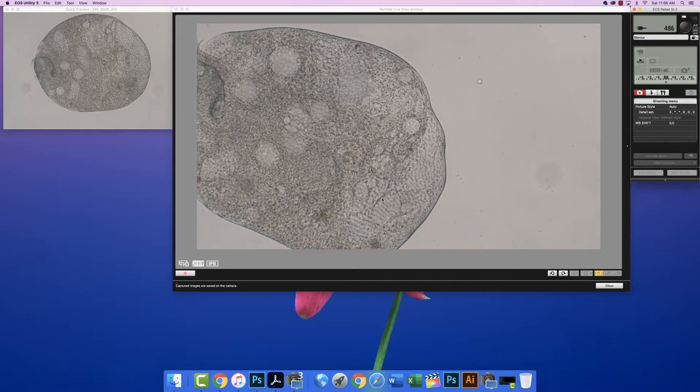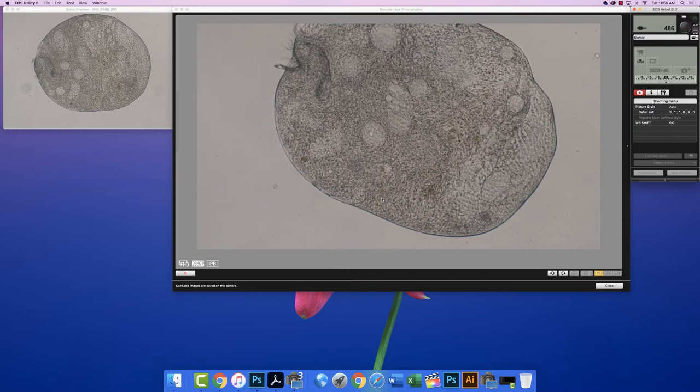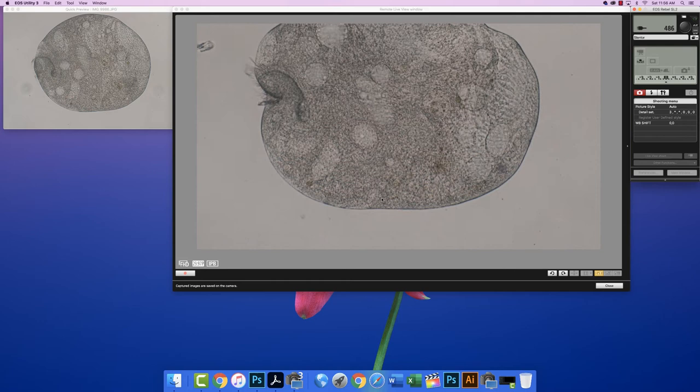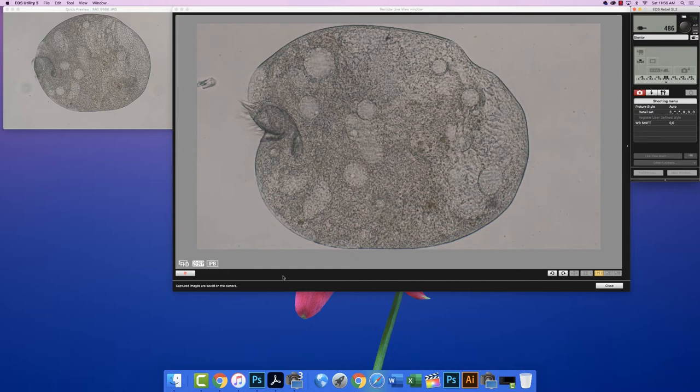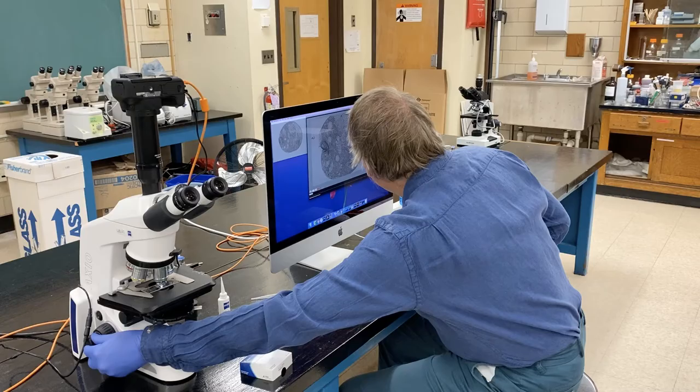Okay, so let me see if I can recenter this guy a little bit. He kind of rounded up, and he's a little fatter, so he's not fitting on the screen quite as well. I'll turn the camera again to try to line him up a little bit. Like that, and now, this red dot shows up when it's recording, and it begins counting how many seconds the video has been rolling.